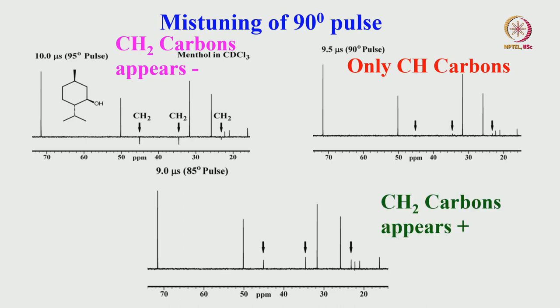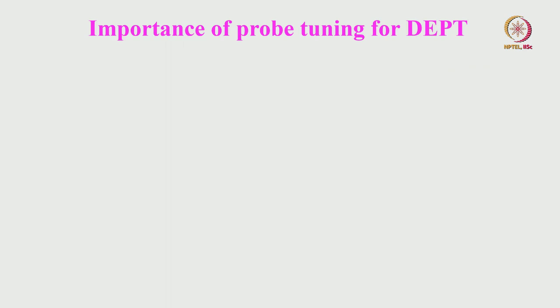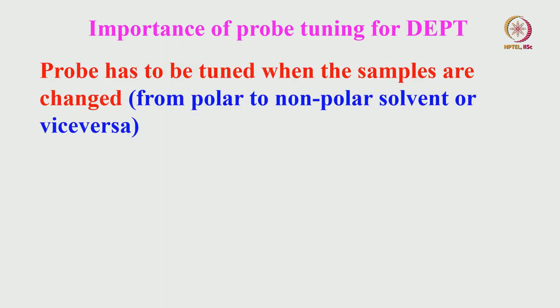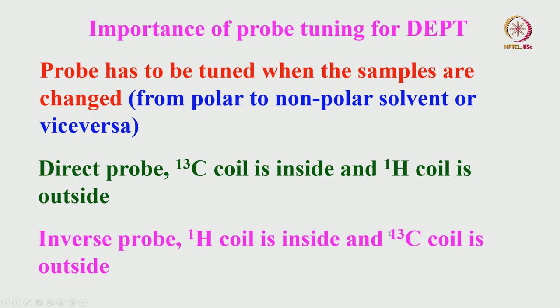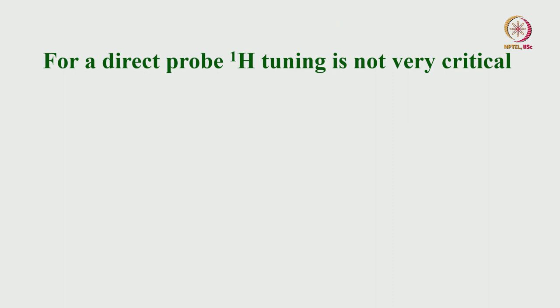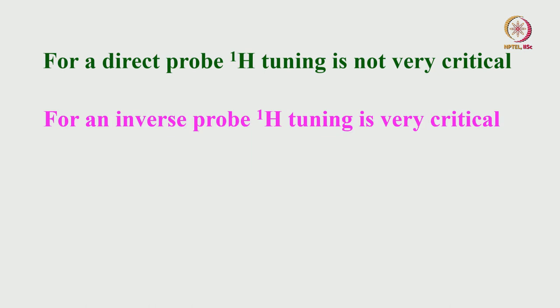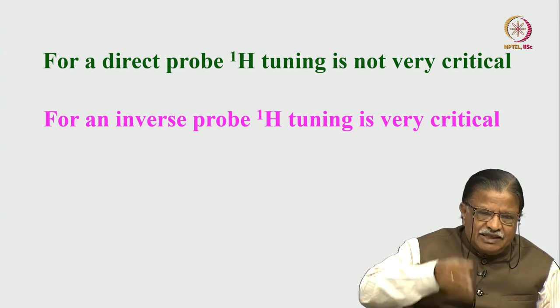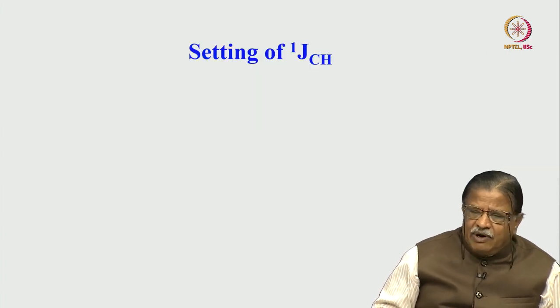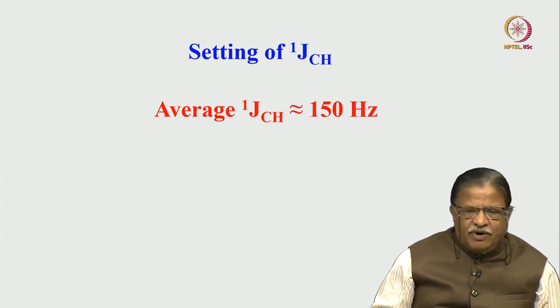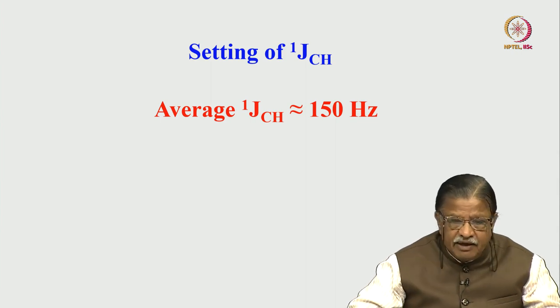There are two types of NMR probes: direct detection probes where the ¹³C coil is inside and the proton coil is outside, and indirect detection (inverse) probes where the proton coil is inside and the ¹³C coil is outside. For direct probes, tuning is not very critical. For inverse probes, tuning is very critical—slight variation in the flip angle can cause CH₂ peaks to appear as positive or negative when only CH peaks should appear. Additionally, the J-value setting is important: the average ¹J_CH is taken as 150 Hz, but if the actual coupling deviates significantly—for example, a C-H coupling of 240–250 Hz as in some specialized carbons—the CH peak may not appear in DEPT-90 or DEPT-135, causing artifacts.